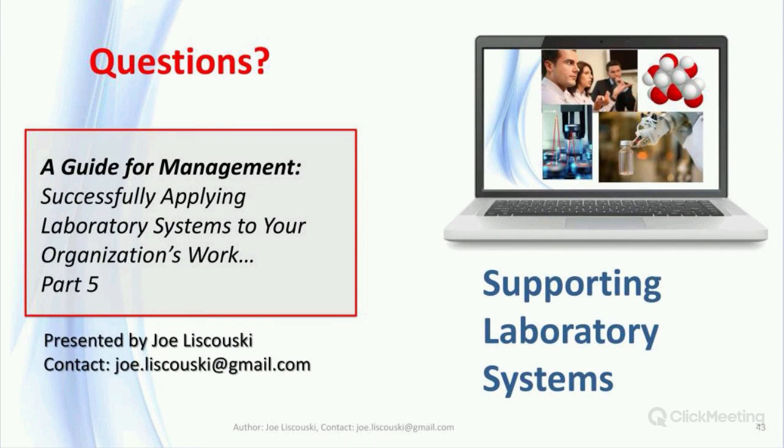Make sure IT knows what you're purchasing and what the support strategies are. But the most important thing is keeping the lab's operations going. As I pointed out a few slides ago, if the corporate policy is that everybody's operating system will be upgraded to the same level, and that upgrade causes the laboratory's computer to crash or the application not to work, then they've got to make a pretty quick decision on what their priorities are.